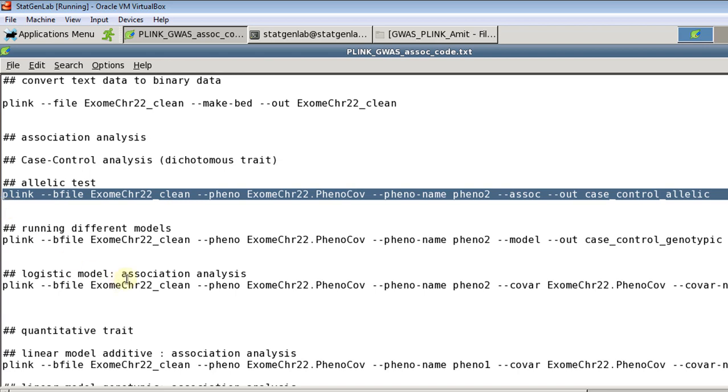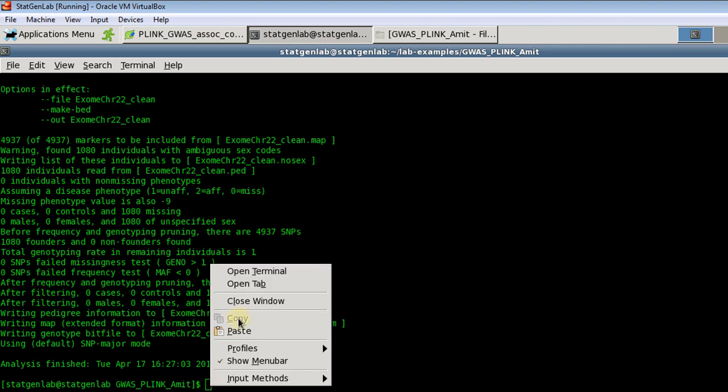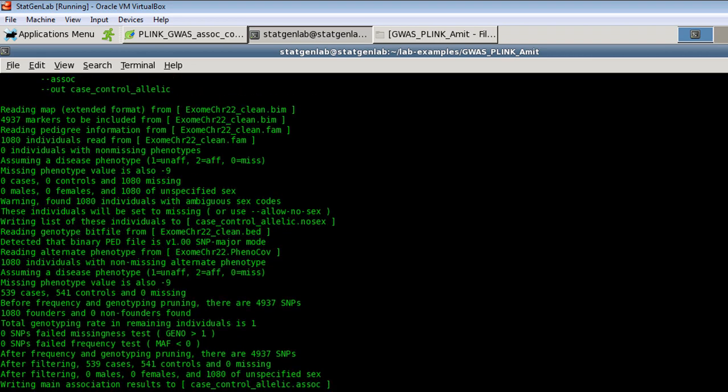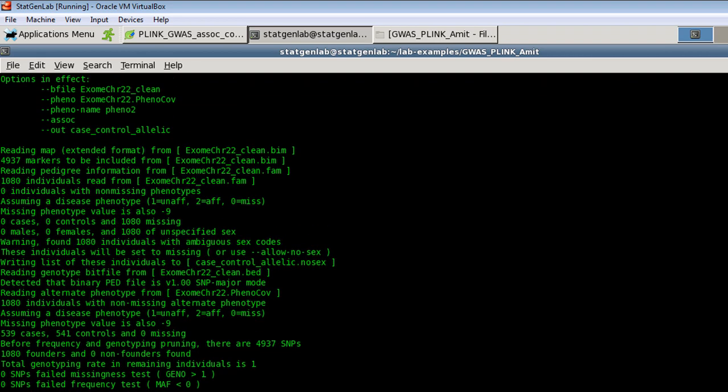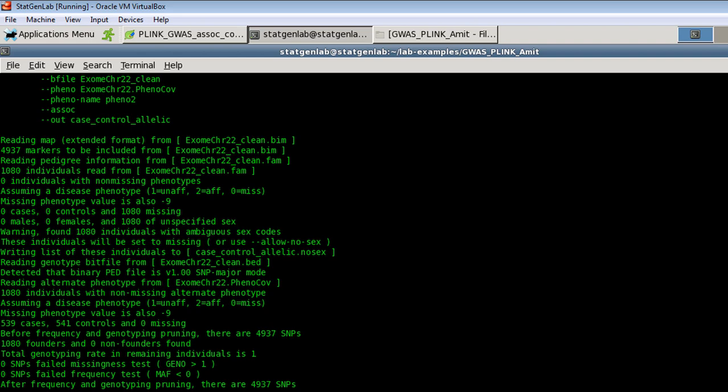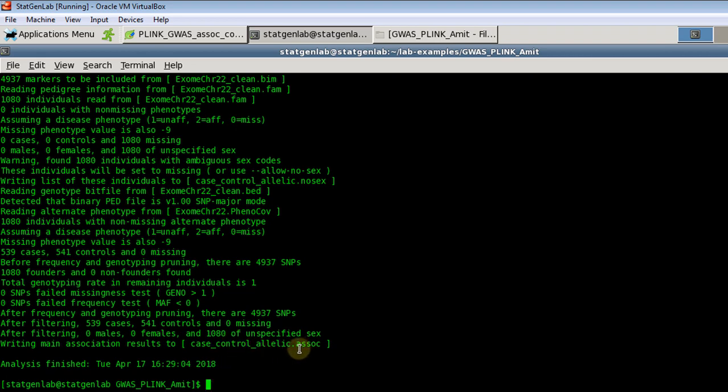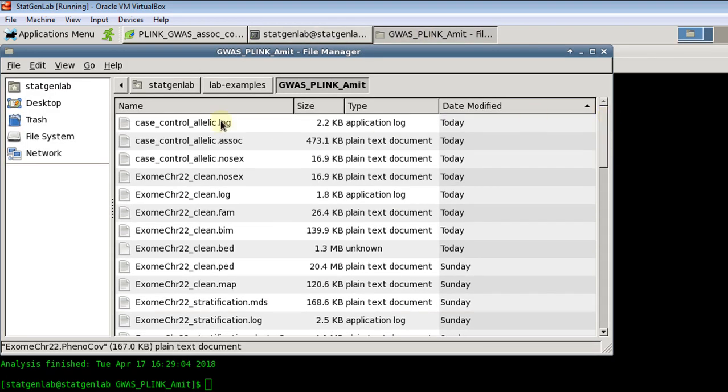So let's run the script to perform association analysis with allelic test. Now since it's really small data set it runs very quickly otherwise it would take probably a few seconds to a few minutes depending on how big your data sets are. So again like any other Plink log it tells you how many markers it read, how many individuals were there, and then it will say what output file it created based on your option. So here we asked for allelic test. So the output extension is dot assoc. So Plink created this case control allelic assoc output file. So let's go ahead and open this output file.